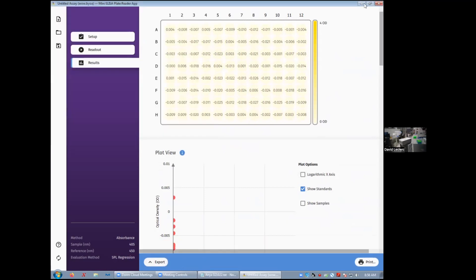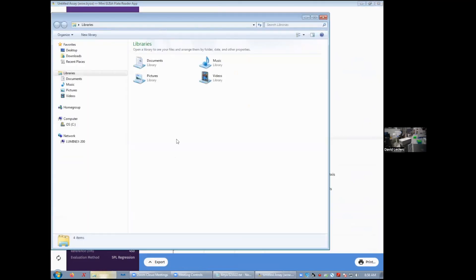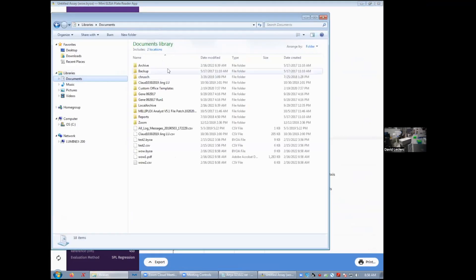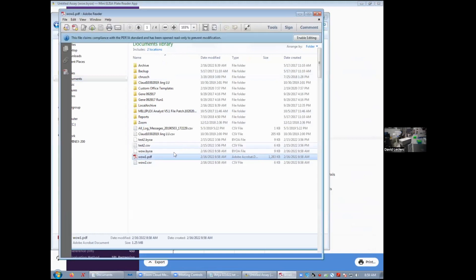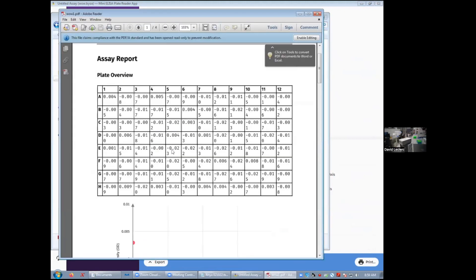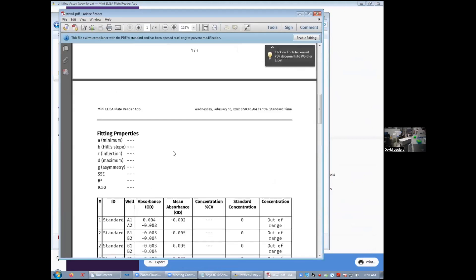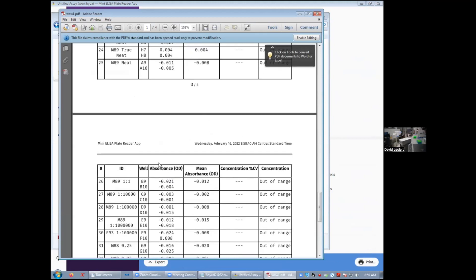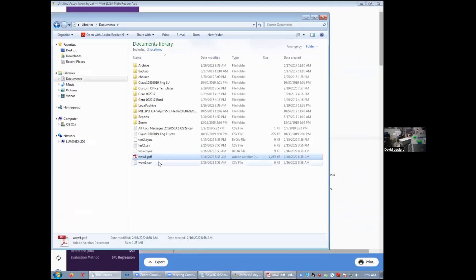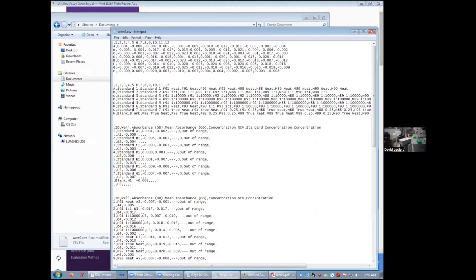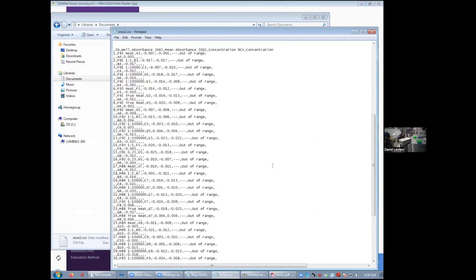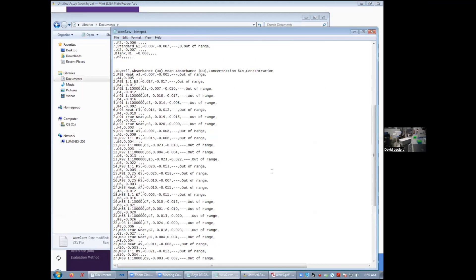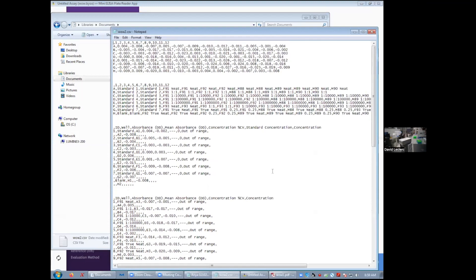Now, if I go to my document folder where I save those files, you'll find my PDF first, which is essentially a display of what we had in the app or the CSV file that you can open through a spreadsheet and redo the analysis any way you want.